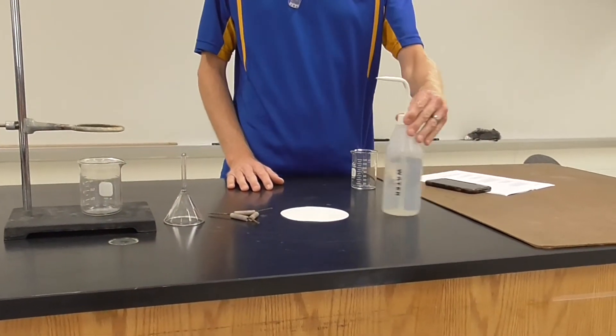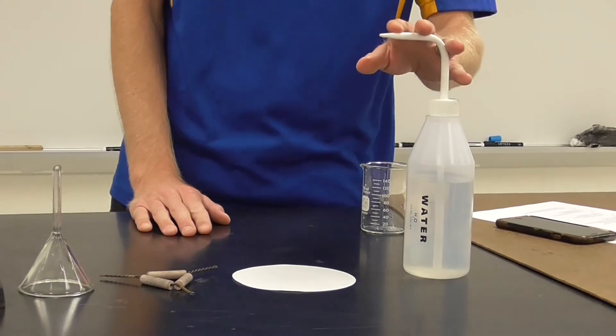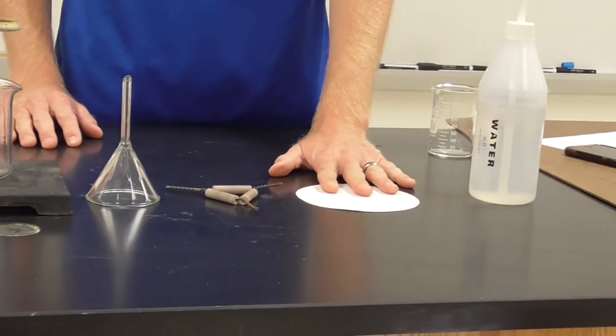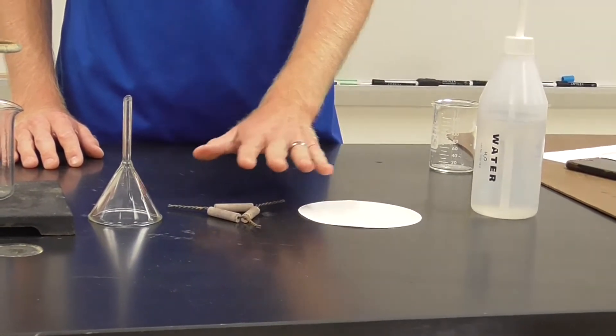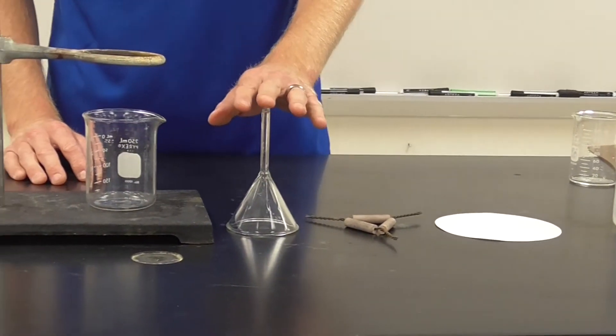What you would do is you would set up a filtration. For a filtration, what you'll need is a wash bottle, filter paper, clay triangle, and a funnel.